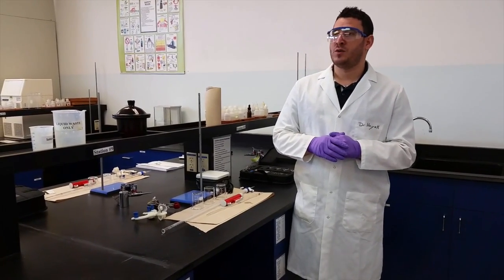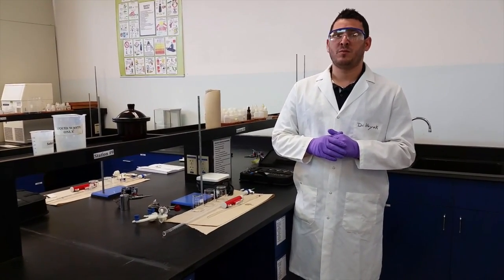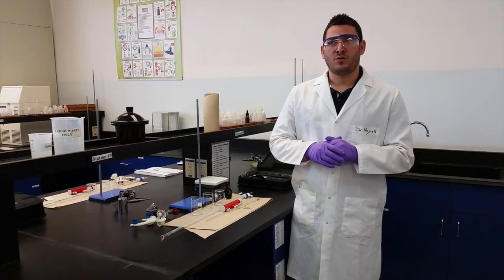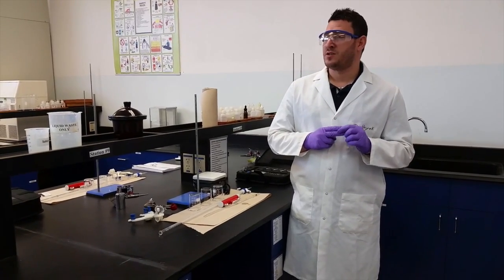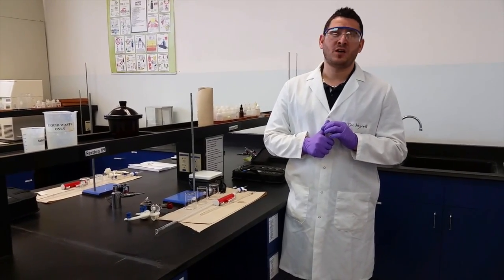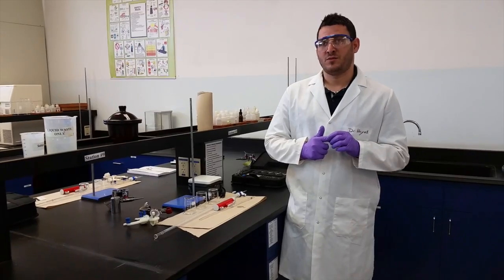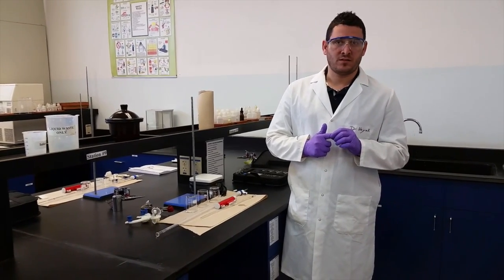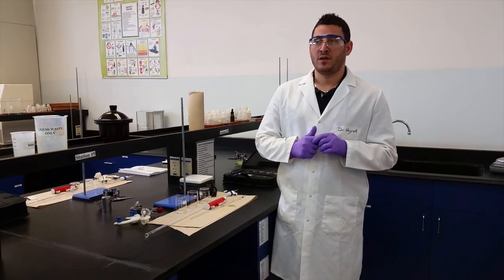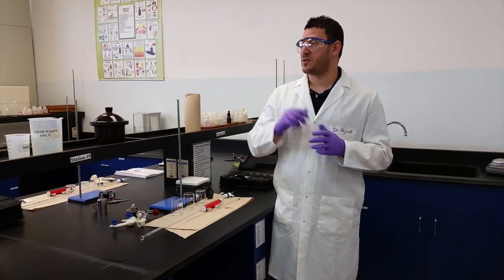But today, we are going to study the quantitative aspect of it, where you will measure the pH at every point of the titration. So you will have to titrate 2 acids. The first one is a strong acid, hydrochloric acid, with a strong base, potassium hydroxide. And the second is acetic acid, which is a weak acid, or ethanoic acid, it's the same, with the same base, potassium hydroxide. Okay? You will collect data for both titrations, and then you have to answer questions.